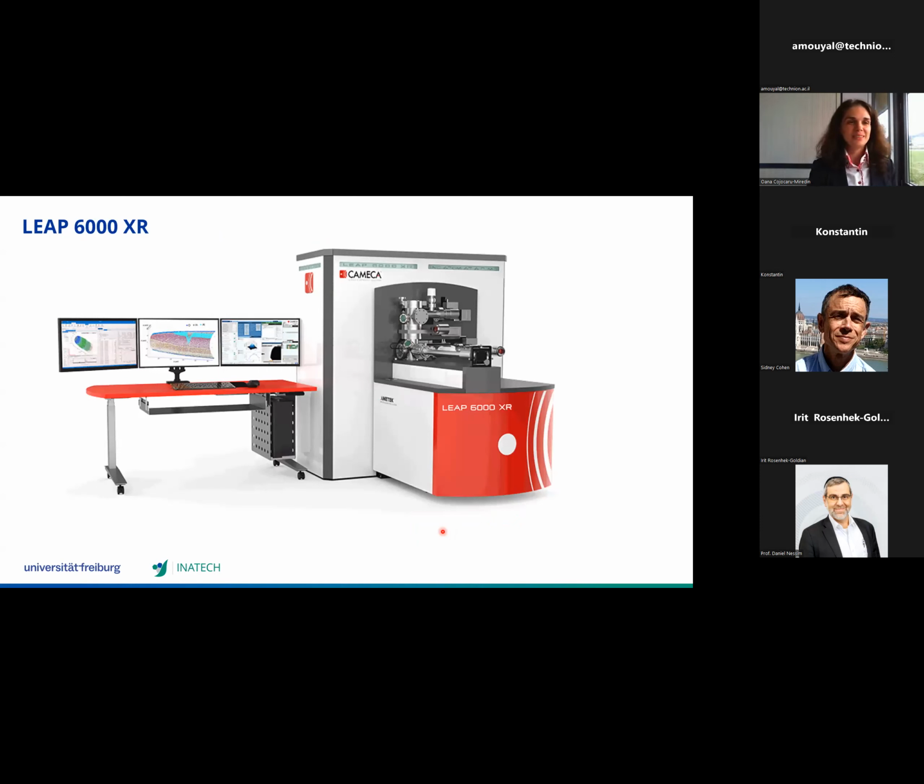This is the LEAP system 6000 XR. So it has nothing to do with what Erwin Müller had at the beginning, these small crystal tubes. But here indeed we have really a big setup. On the left-hand side, we have the software. On the right-hand side, we have the hardware.